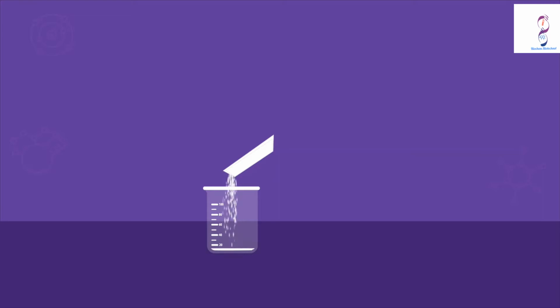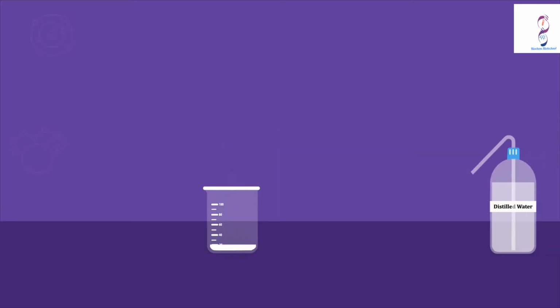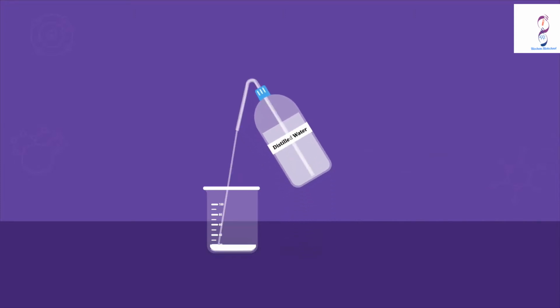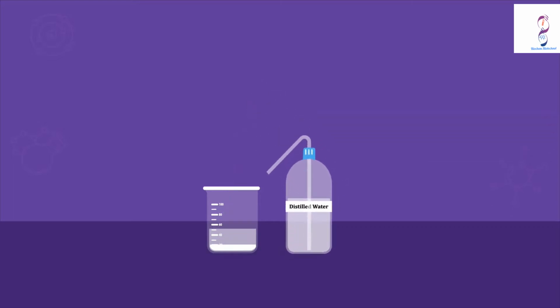Ribose is a constituent of RNA, and the related molecule, deoxyribose, is a constituent of DNA. Phosphorylated pentoses are important products of the pentose phosphate pathway. Most importantly, ribose 5-phosphate, which is used in the synthesis of nucleotides and nucleic acids, and erythrose 4-phosphate, which is used in the synthesis of aromatic amino acids.